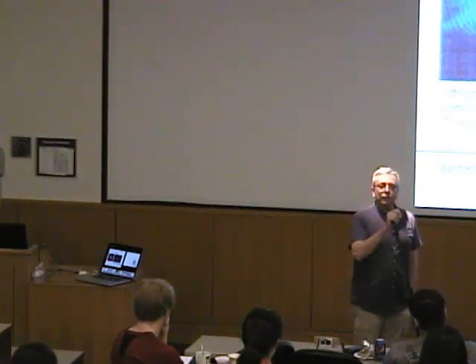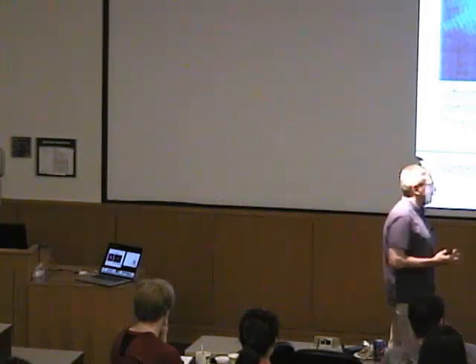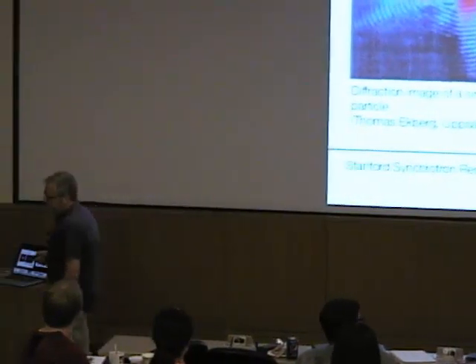And then you check if you by accident hit a crystal, and if that crystal diffracted, and then you try to extract diffraction data from that. So it's not exactly subtle, right? But it does work, and it's very much in development. And of course, it's something that one may want to keep an eye on.